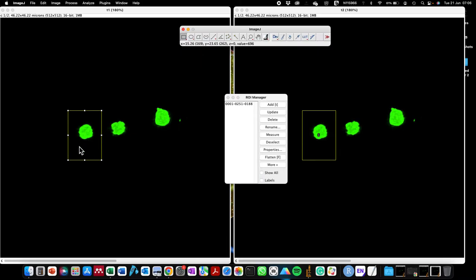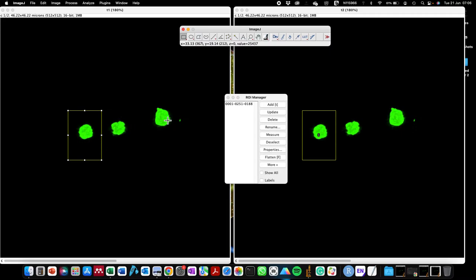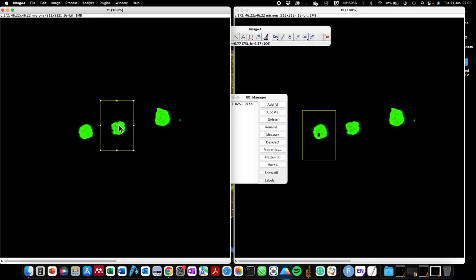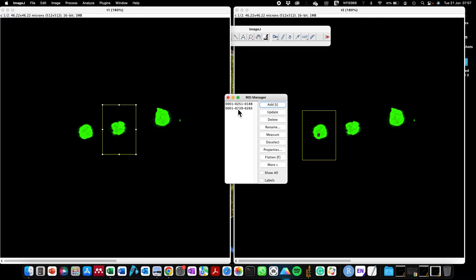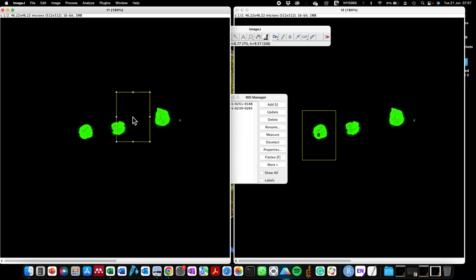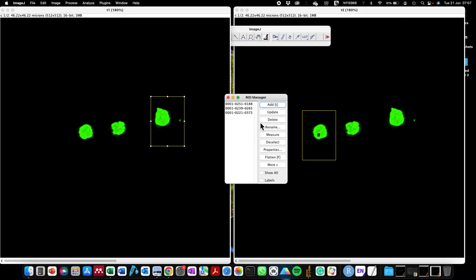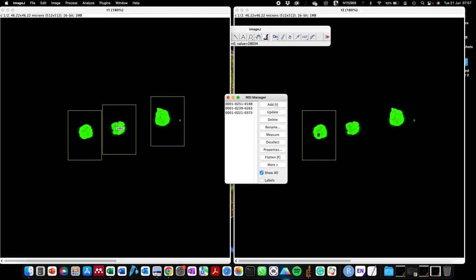Now I'm going to show you how to duplicate this region of interest on your image. If I'm interested in moving this region of interest to another part of the image, I just move it — you can see the cross cursor, and when it's inside the ROI it becomes an arrow. I move it to the next region I'm interested in and click Add. You can see that has created the second region of interest. I move it again to the third location and click Add. If I then want to see the three regions of interest, I click on Show All, and this automatically draws all three.